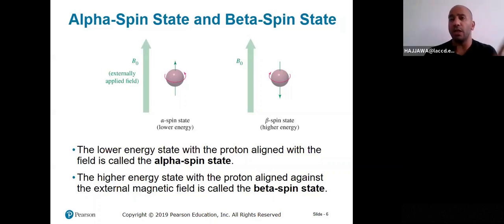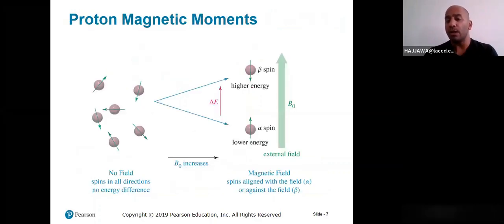The difference between the two energies is basically what generates peaks in an NMR spectrum. What you see on the NMR spectrum is basically a bunch of peaks. They are the result of having the nuclear spin, the alpha and beta subtraction. That energy will be reflected in those peaks.